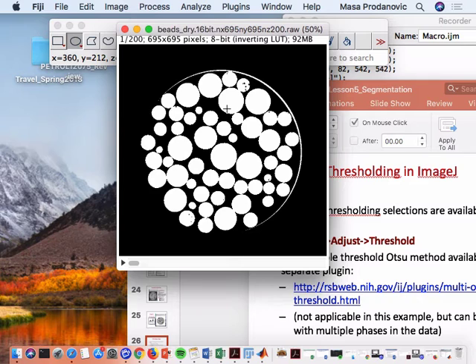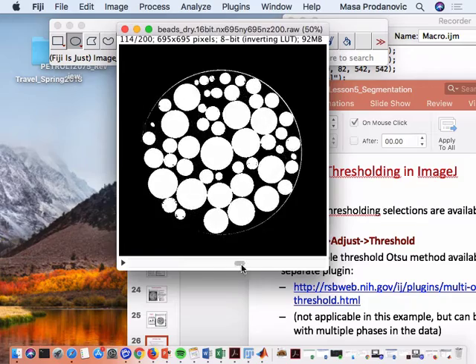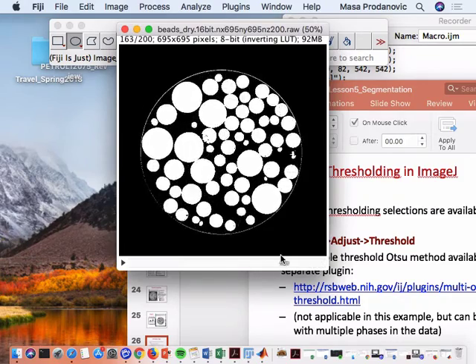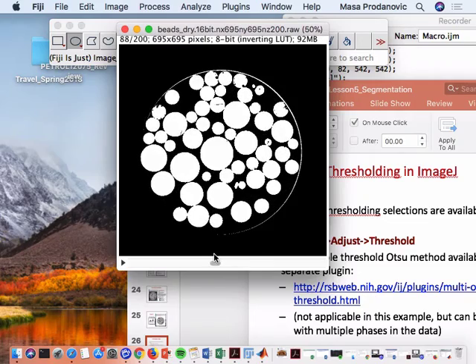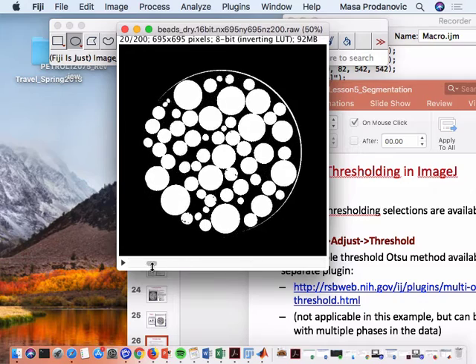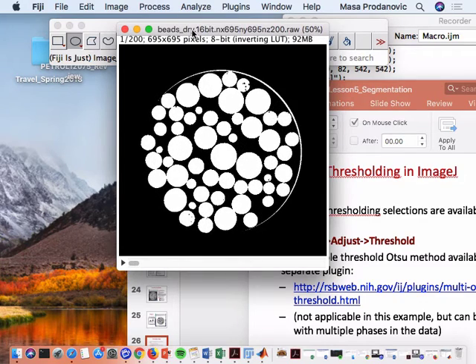What do you see? I have here a half moon of sorts. Okay. So this is how much I went into the cylinder. You can see little mistakes like that, and there's less of it as I go up because the image is essentially slightly slanted. If you're bothered by that, you can start all over. Okay.